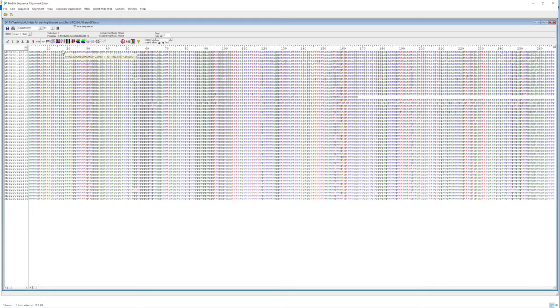And then for each of those samples, we have split the reads into reads belonging to each primer for each exon of each HLA gene that we're interested in, HLA A, B, and C. So in total now you would have HLA A, B, and C times 2 exons, that's 6, times by forward and reverse primers, that's 12 different files.